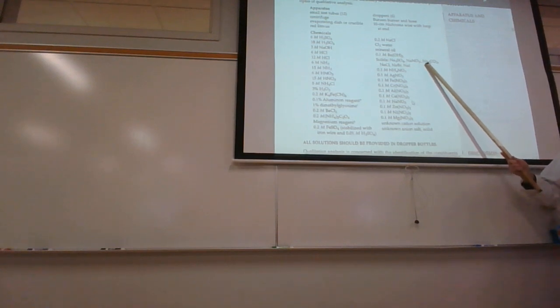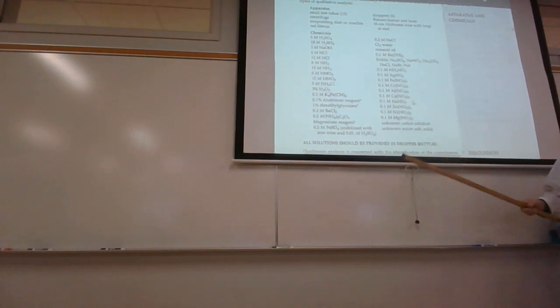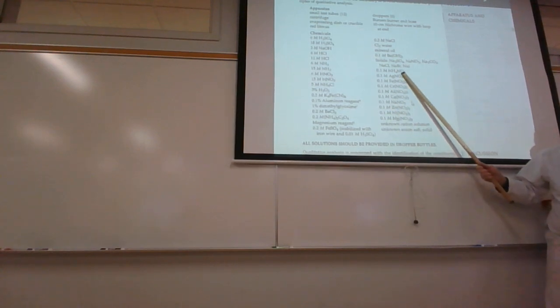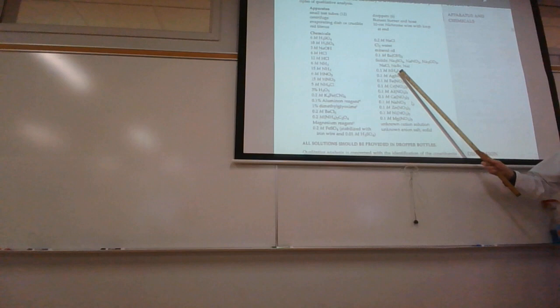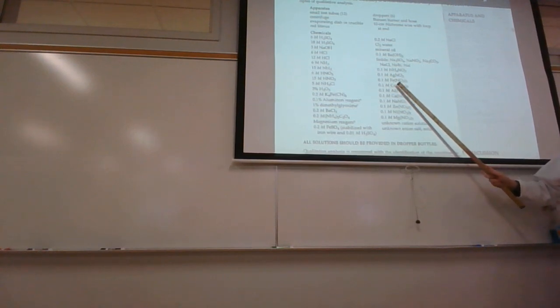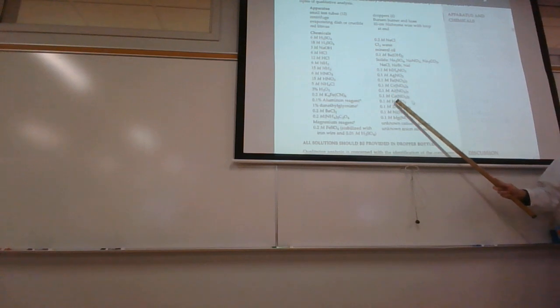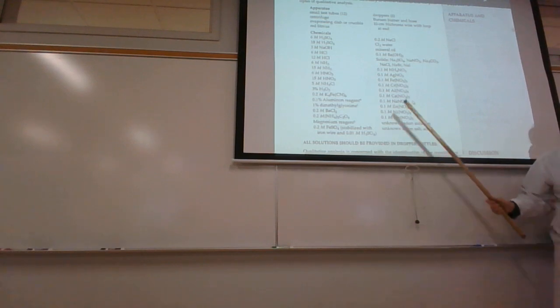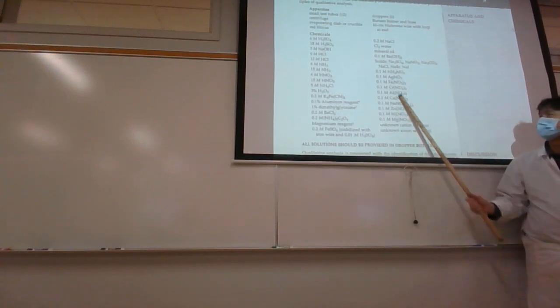I think we're going to skip some of the solid analysis. And then these 0.1 molar solutions of all nitrate salts. Why nitrate? Because nitrates are all soluble. So ammonium, silver, iron(III), chromium(III), aluminum(III), calcium(II). Well, calcium is always 2. Sodium, zinc. Zinc's always 2. Nickel. Nickel can be 2 or 3. Nickel(II). Magnesium. These are the knowns. So these are the cations we're analyzing.